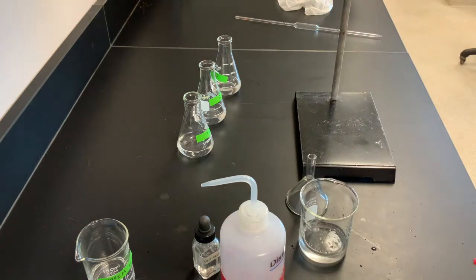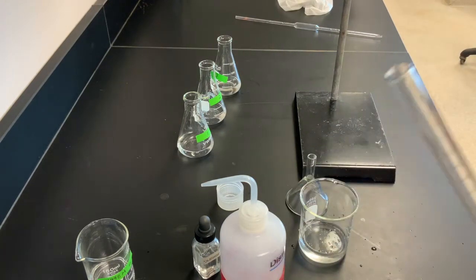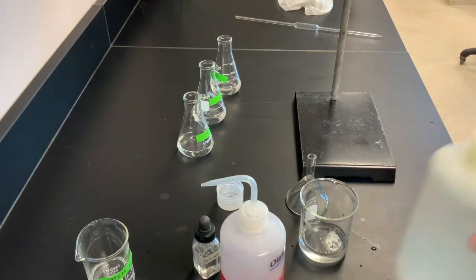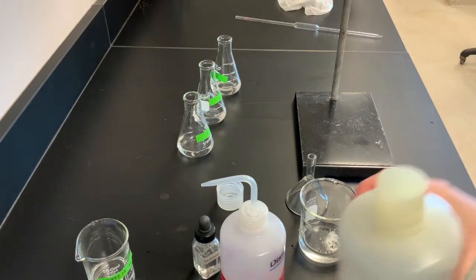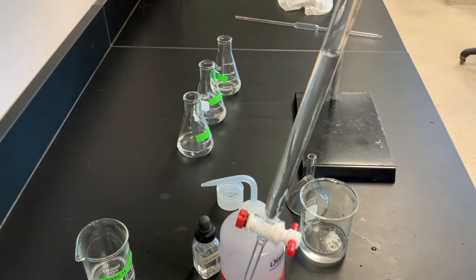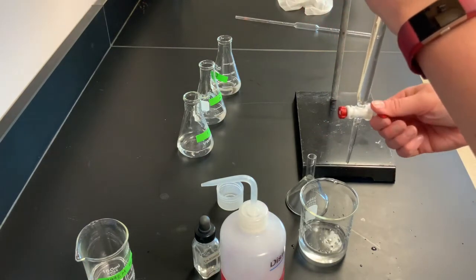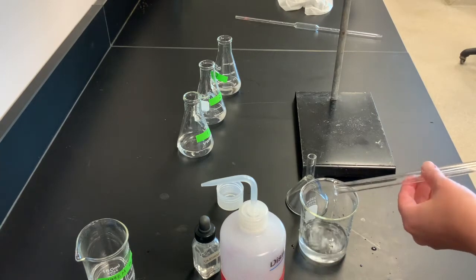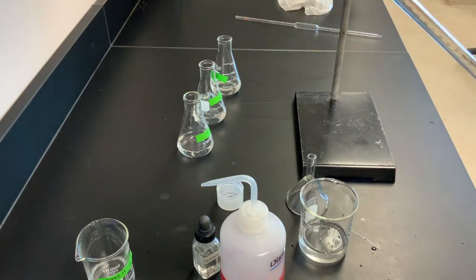So what we're going to do is take our sodium hydroxide and pour a small amount into our burette. And we want to do the same thing we did with the water. So again, just a small amount, it's not filled all the way. We want to let some run out the bottom to remove the water. And then we want to coat our walls with it. And we would go ahead and do that several times.